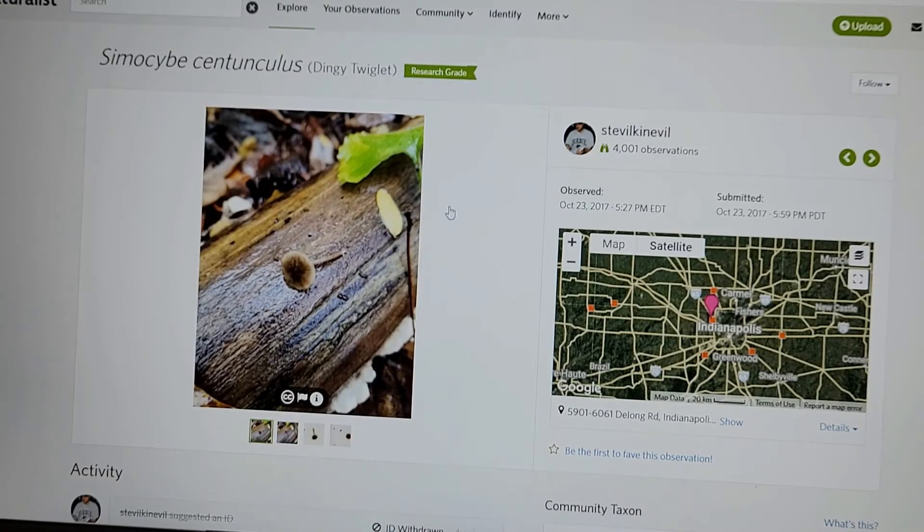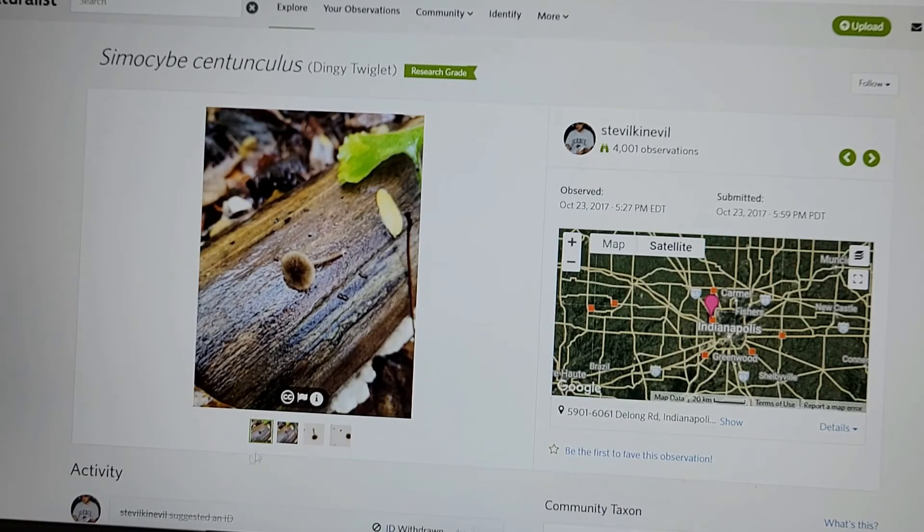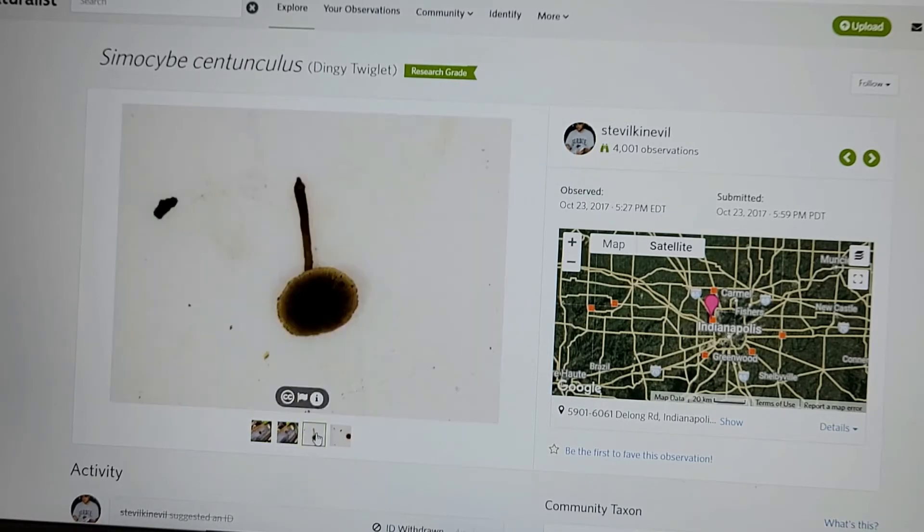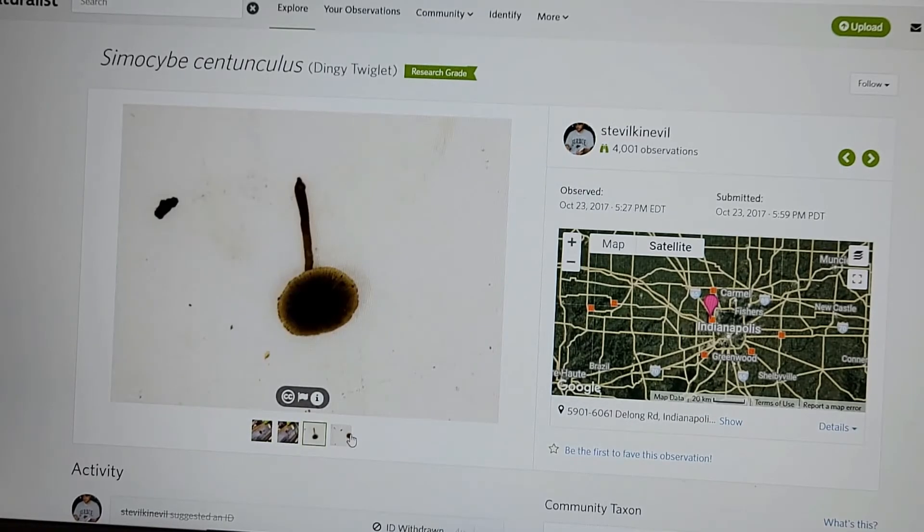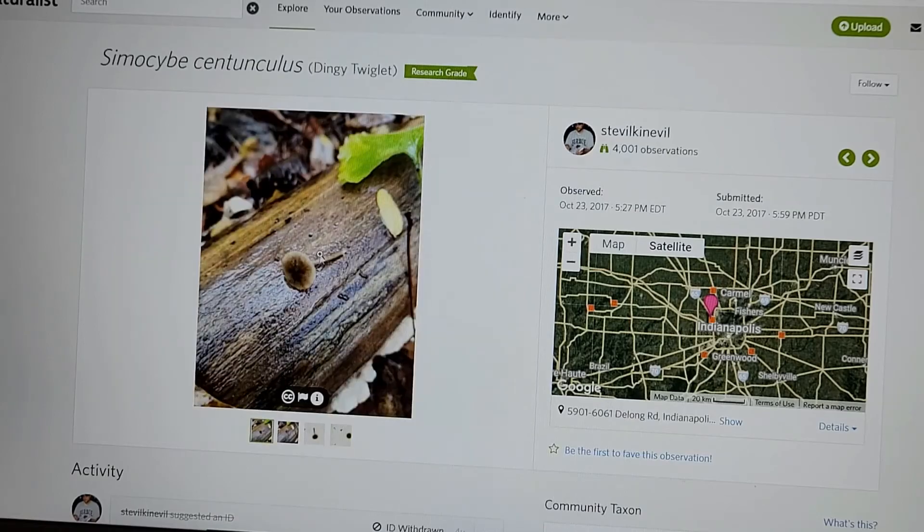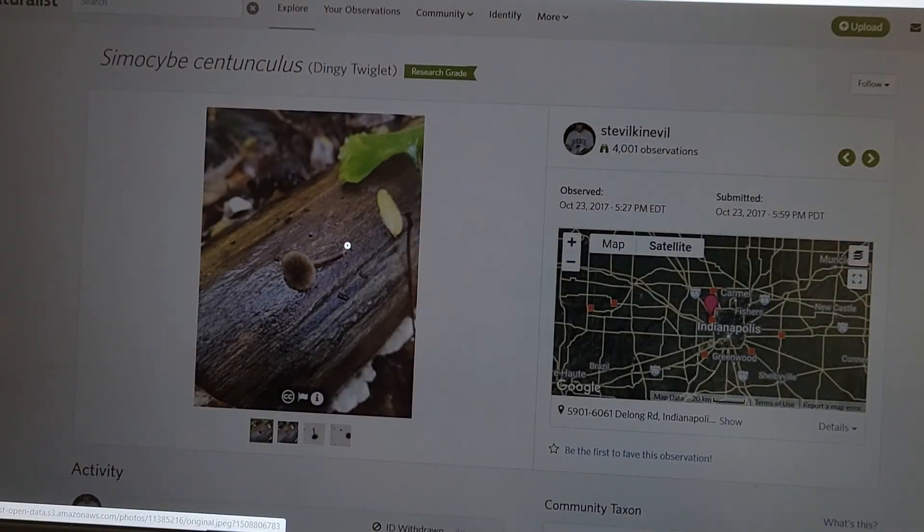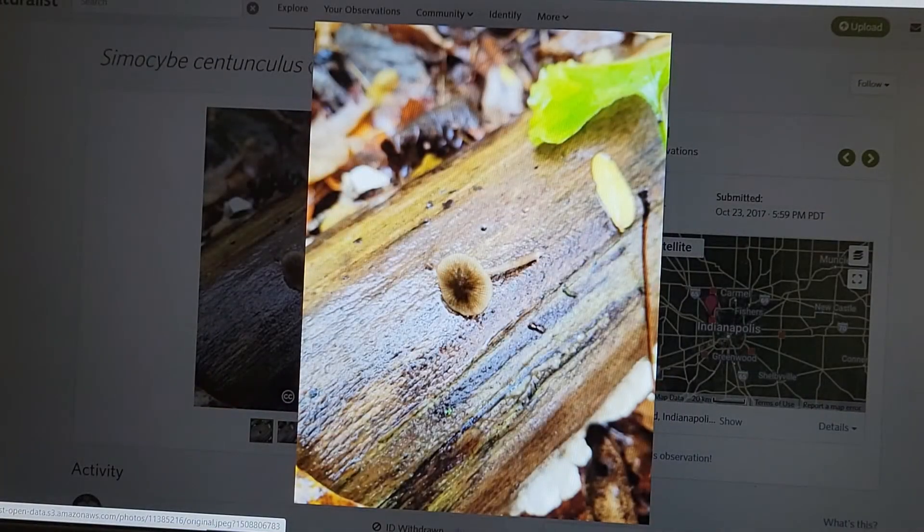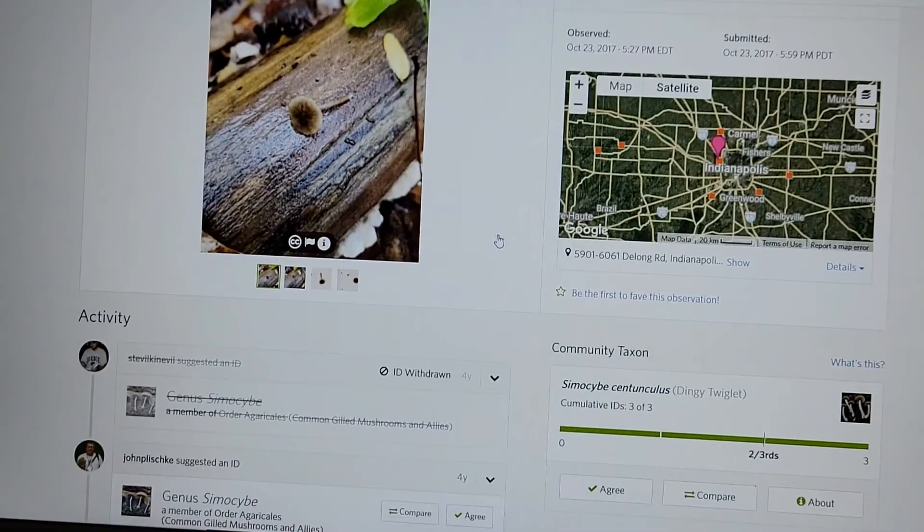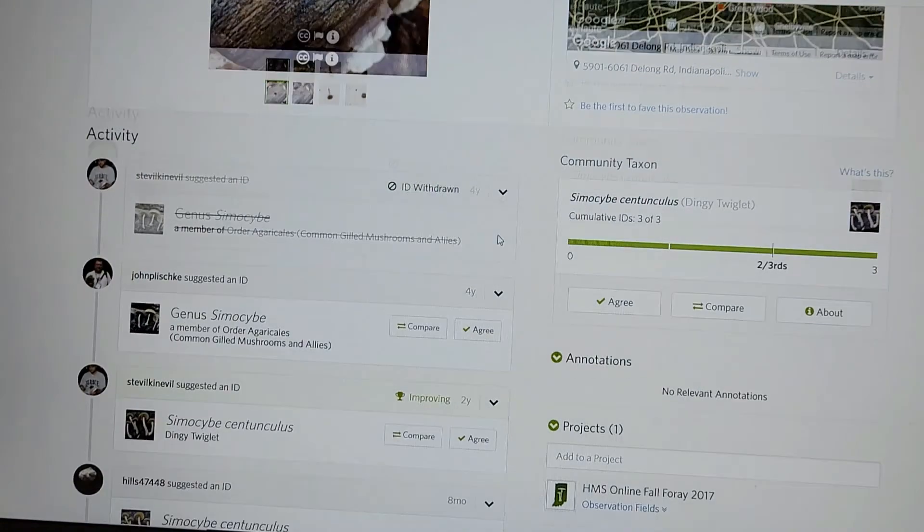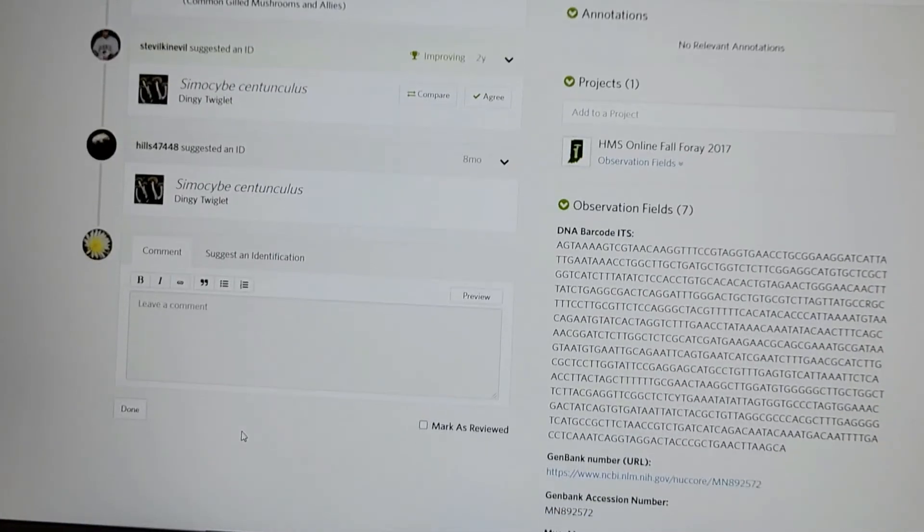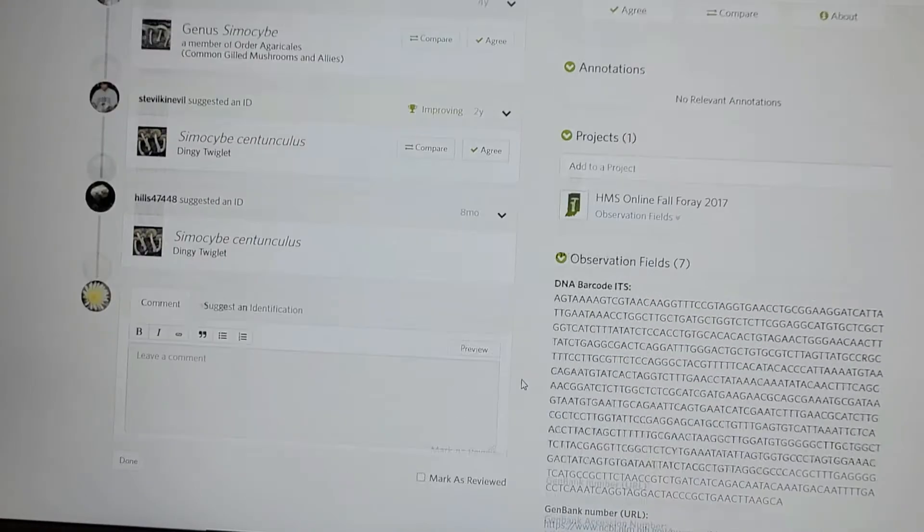So this was collected in Indianapolis. And now I can see pictures of the actual mushroom that was collected. There's a ruler there. I can zoom in. See what it looks like up close. It's not a great photo. And then you can see everybody has identified it. There's the DNA barcode, all this other stuff.